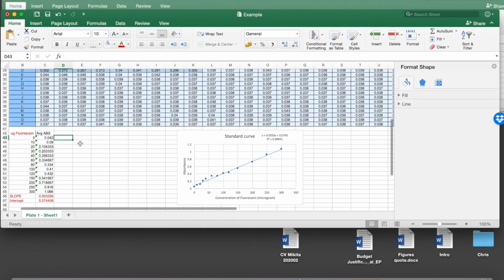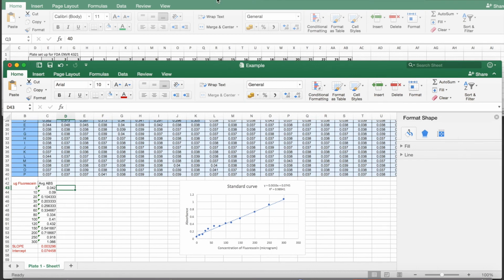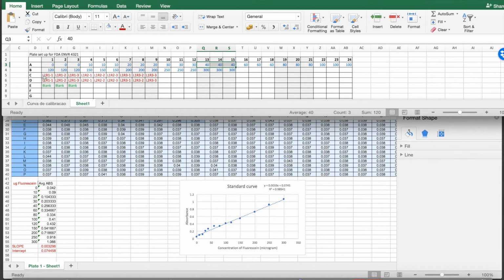Okay, so group 2 had a few samples. Let's look at their setup. So they had samples collected in location 1 and in their first replicate, right? And they pipetted those 3 times. We call them pseudo replicates or analytical replicates. So we pipette the same sample, whereas the true replicates are those that you collected in the field.